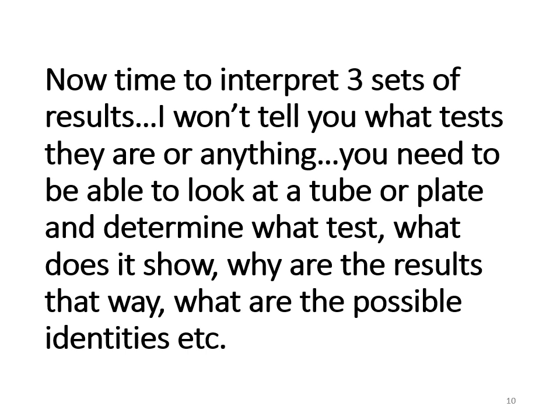So for instance, if there's a change in color, if there is a change in the plate's transparency, if there's a circle, a zone of inhibition or not, you should be able to explain why these things are occurring, and you should be able to identify. And notice that sometimes you can't identify a single strain. Sometimes you're just narrowing down. So it's okay for you to tell me that based on this test, for instance, Bile Esculin, if it doesn't turn black or brown, well, that tells you that it's not E. faecalis.